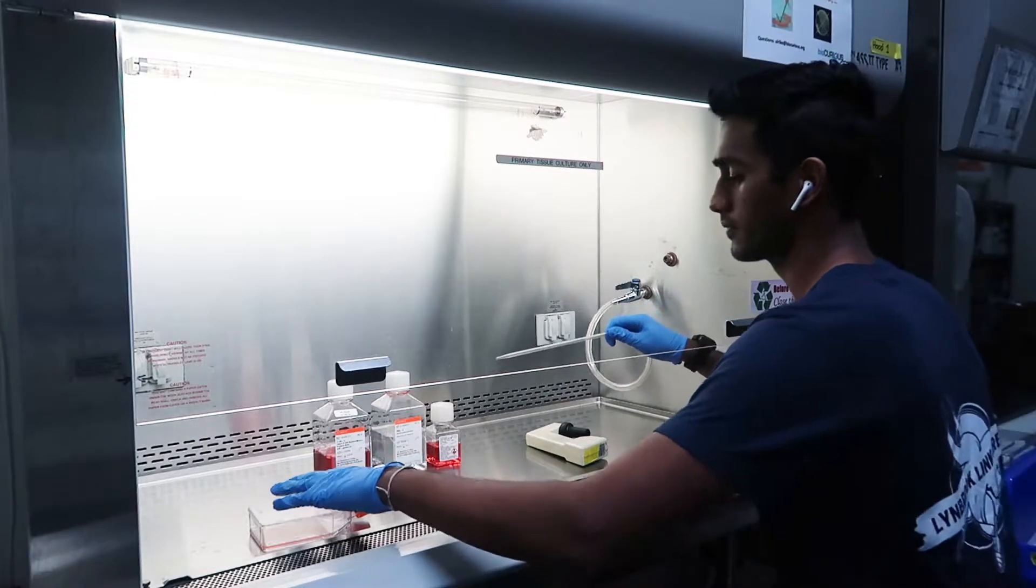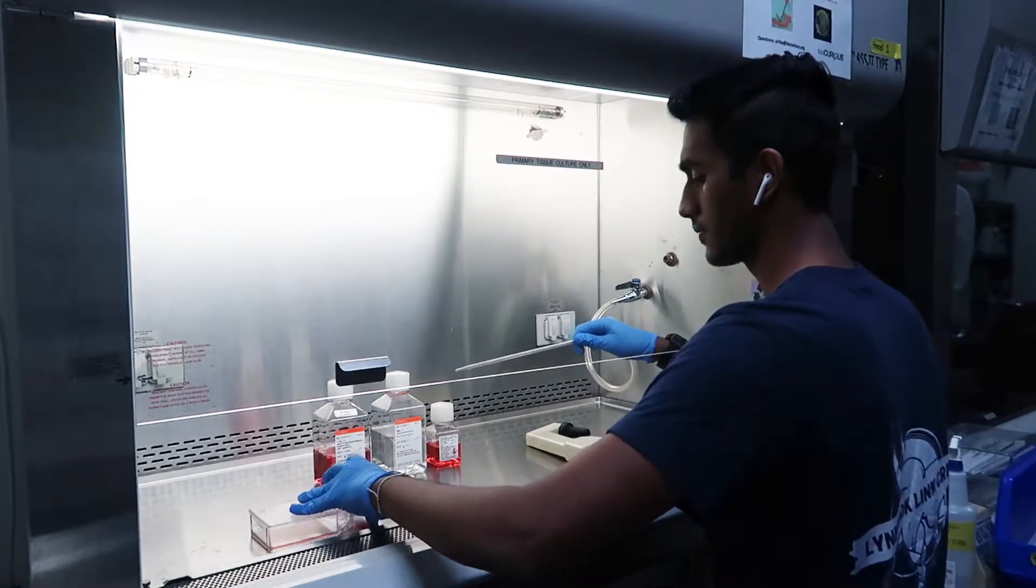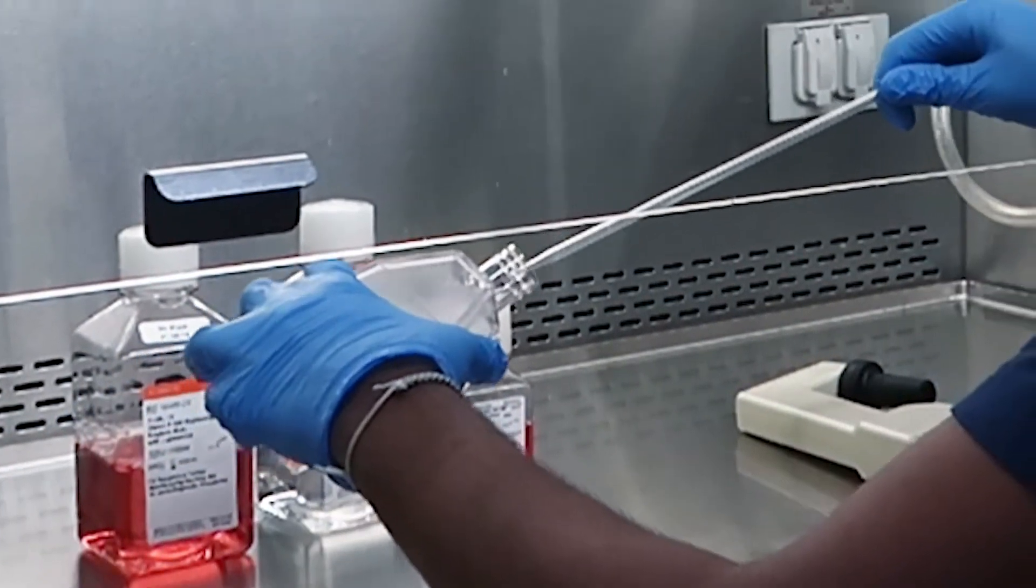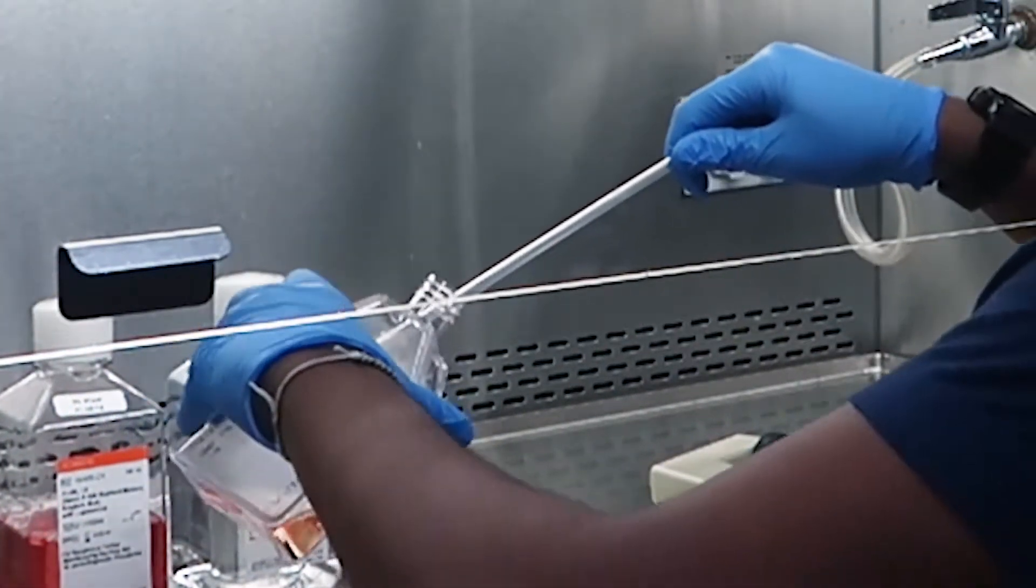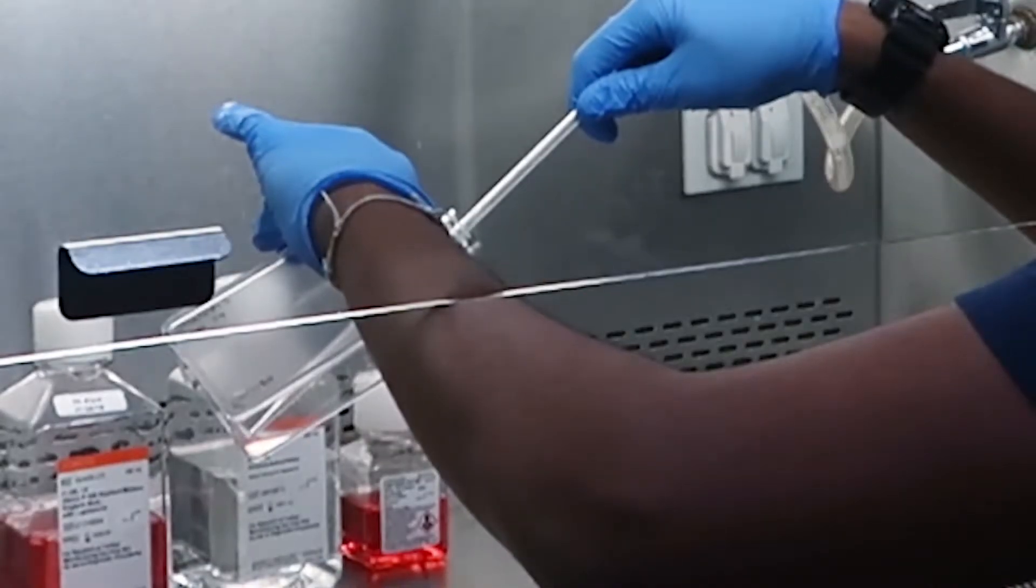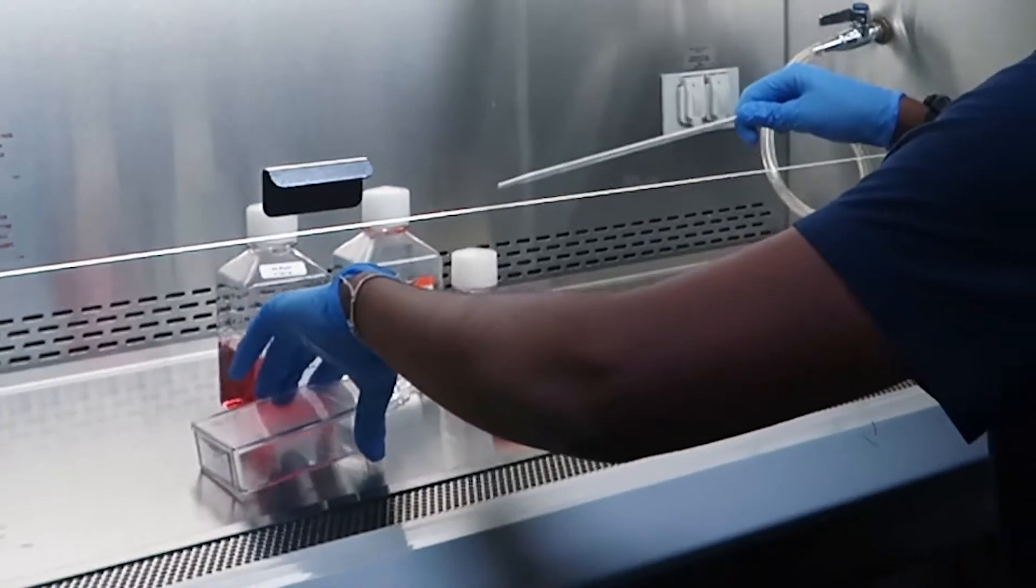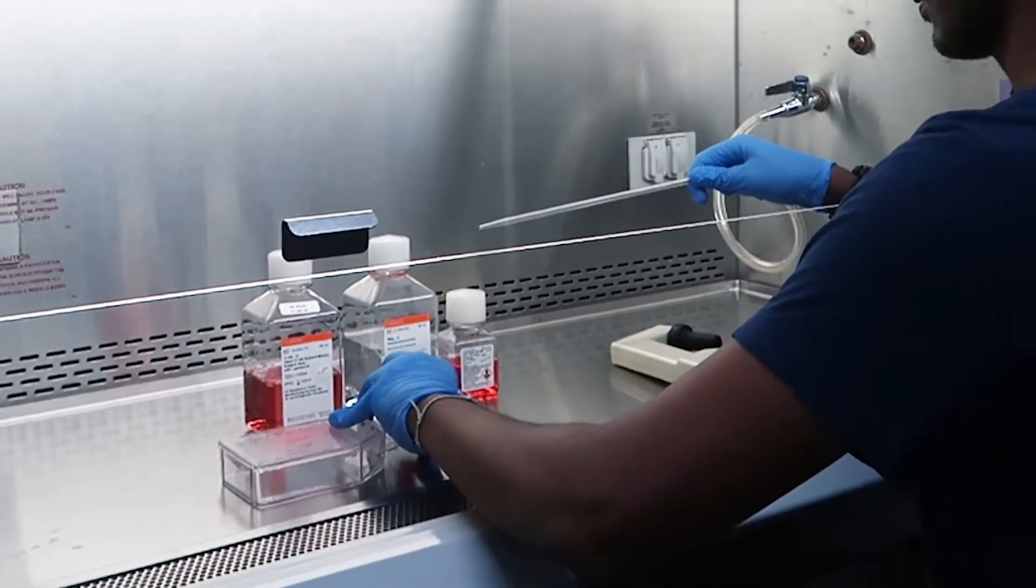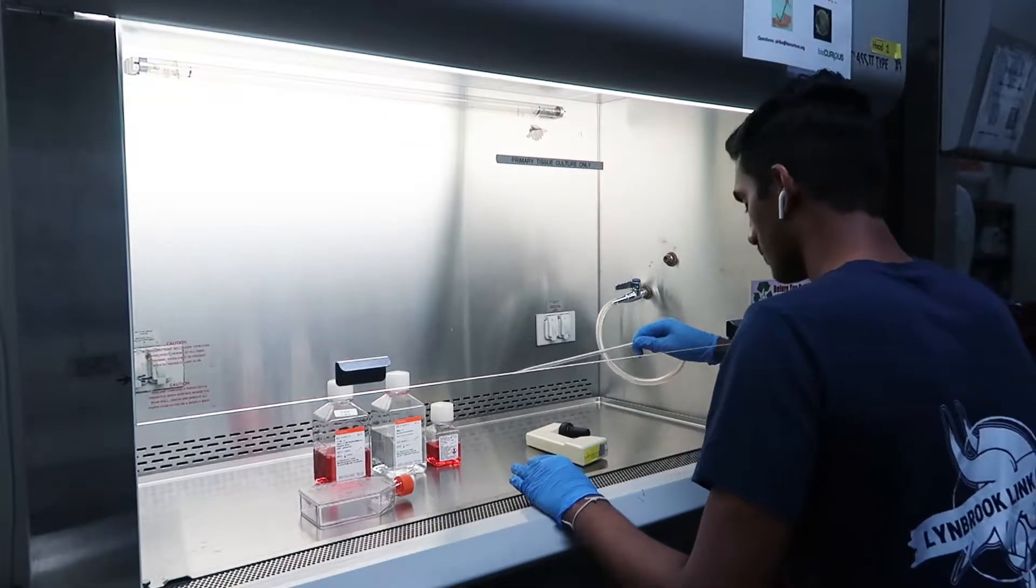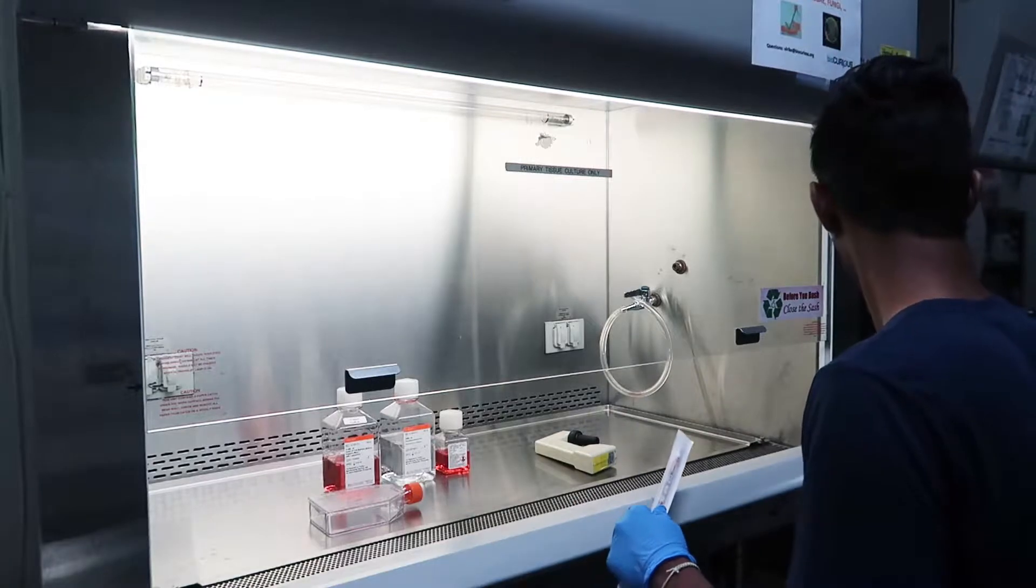Now here, I'm aspirating the medium out of my flask using an aspiration pipette connected to a suction lamp. Make sure when you do this that your flask is tilted so that all of the medium goes to a corner and your aspiration pipette does not touch the cells. Once you finish this step, discard your pipette into a biological waste bin.